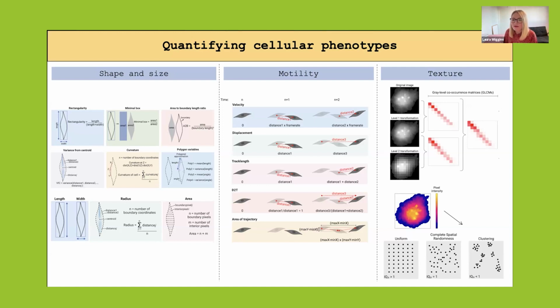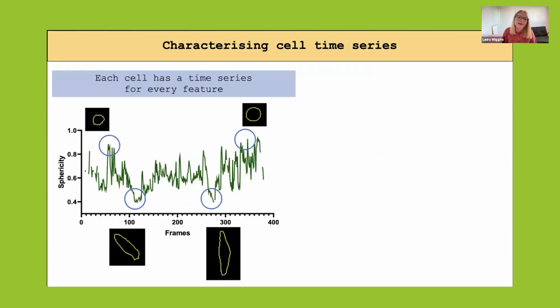And what we found that really useful for is that, for example, with phase images, the pixel intensities relate to mass. And so this actually tells you something about the subcellular region within your cells. And it could be that you could use this for fluorescence images if you expect that the distribution of fluorescence might not be uniform or maybe uniform within your cell interior, but that will tell you something about those as well. So that's what you get from each cell on each frame.